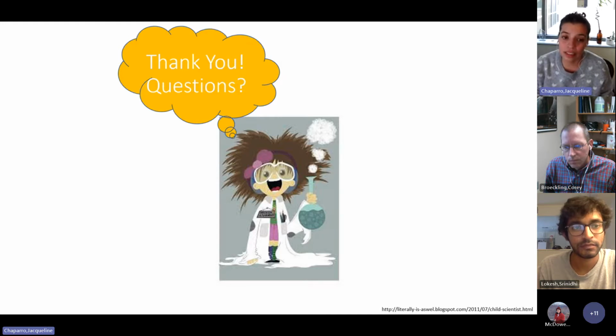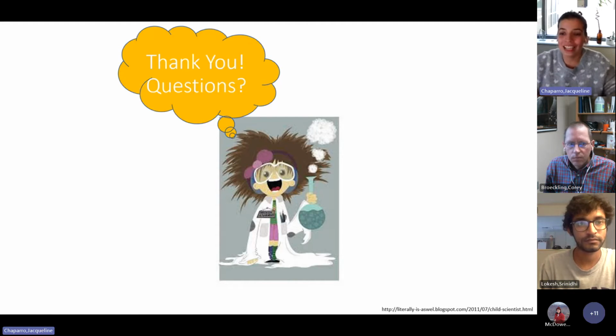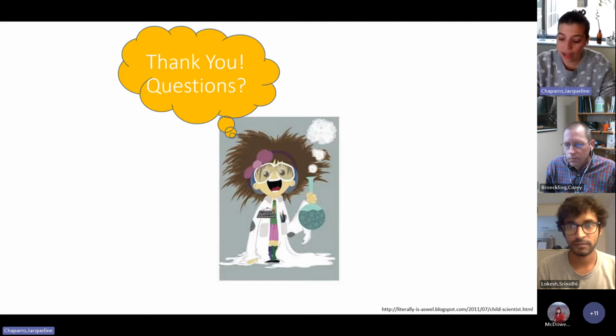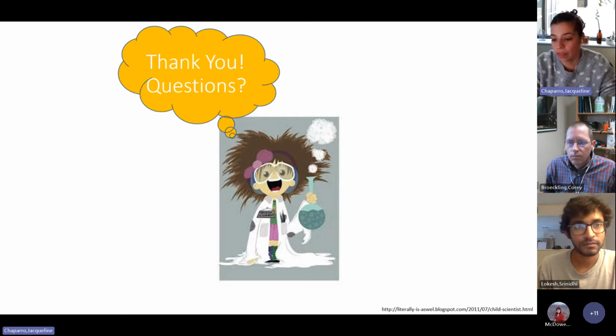In some cases, some of these methods, like for example, EPA methods, don't actually let you use the dynamic reaction chamber for analysis. And so you're limited with respect to some of those methods and to how to report your data. But we're not limited in terms of research that way. And so here, a way to avoid some of these interferences while having nominal mass is using techniques like the dynamic reaction chamber.